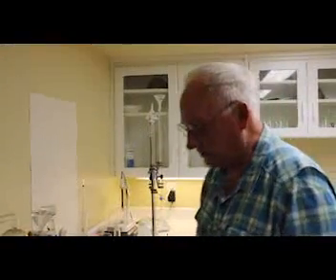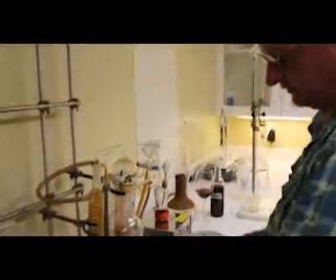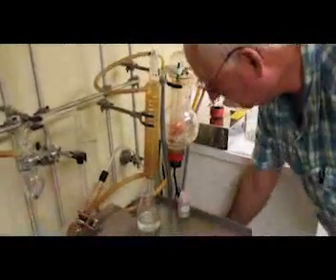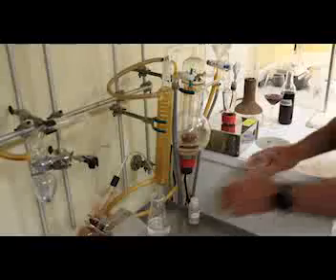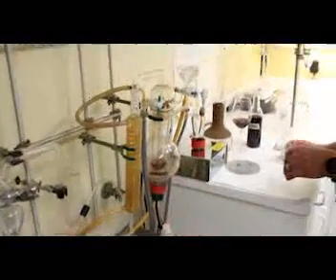Okay, now our sample is up to 100 ml. Remember I said it can be anywhere between 75 and 150, doesn't matter. So I turn off my cash still, and let me grab a beaker over here. Here we go. And I pull out my Erlenmeyer and just put a catcher in there to catch it.